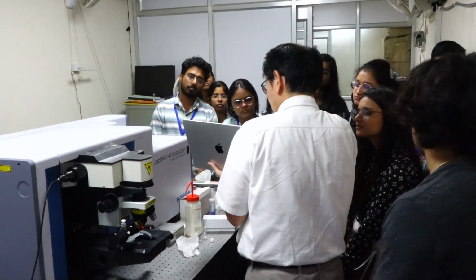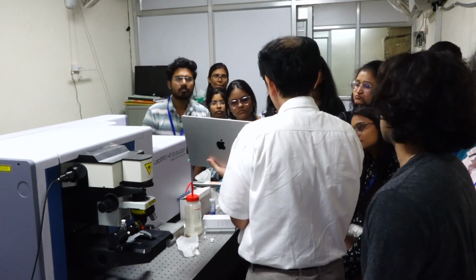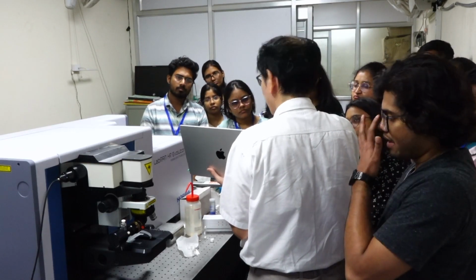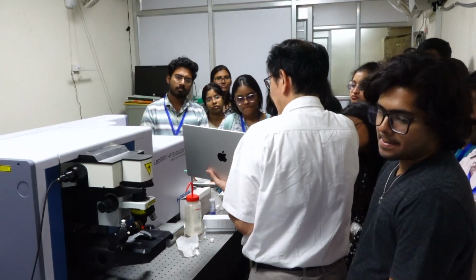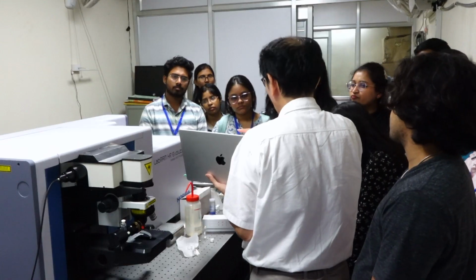So the signal count is now 20 or 30 counts. When we prepare the figure for publication, we need to collect 1 million counts to ensure a good SN ratio.